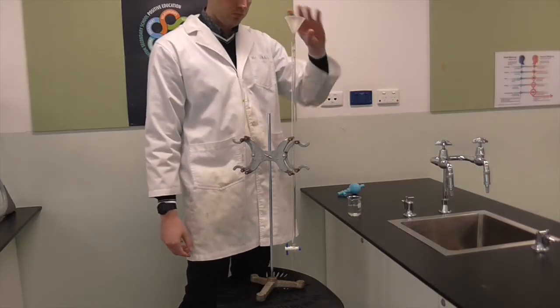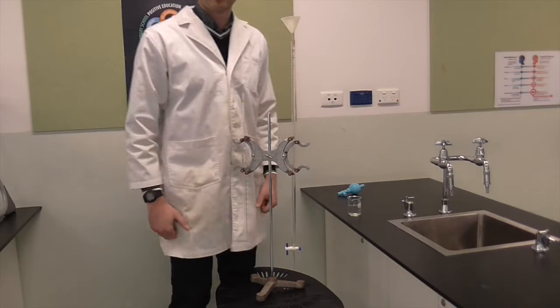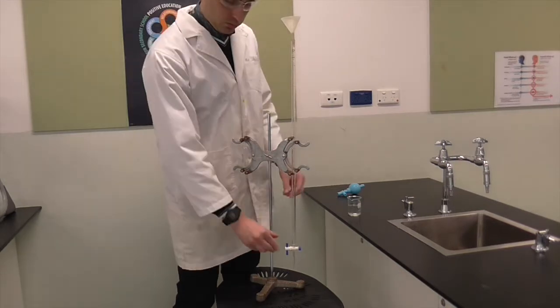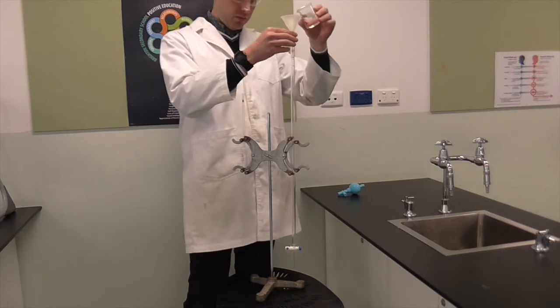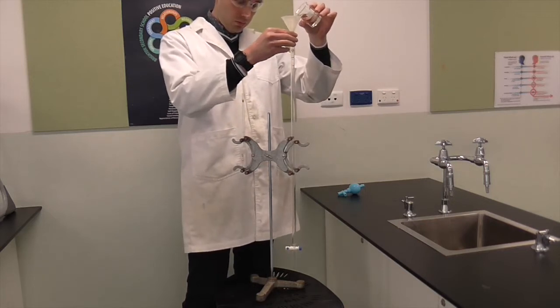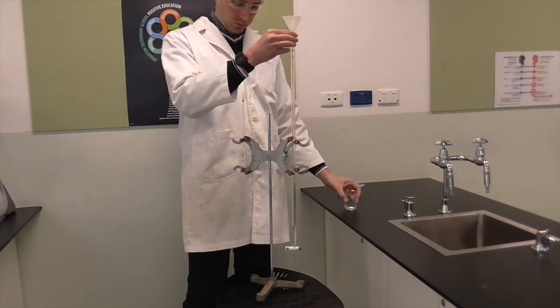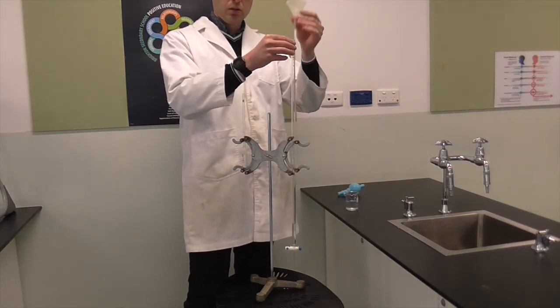Now we're going to fill up the burette. So we're going to rinse the burette. Place the funnel on top, make sure you close the stopcock down the bottom. Then we're going to fill. Hold the funnel slightly above the burette when you do this, otherwise you'll get an airlock. You want to add about 5 ml of water to your burette.